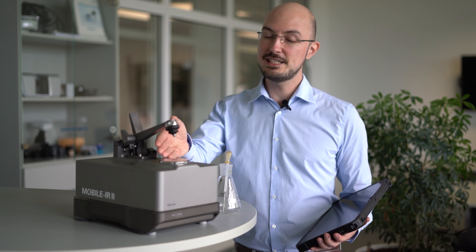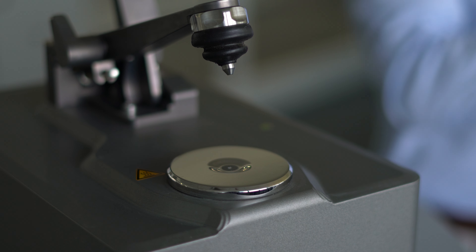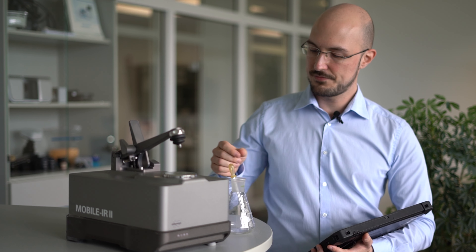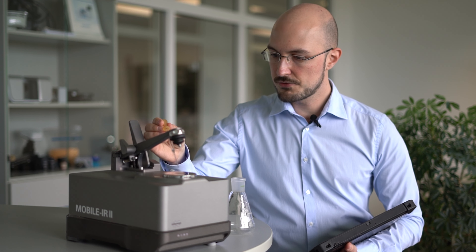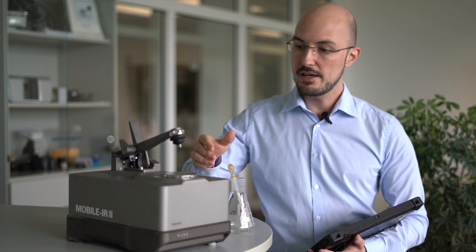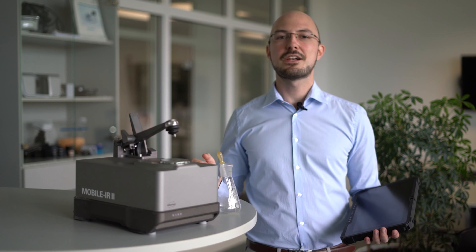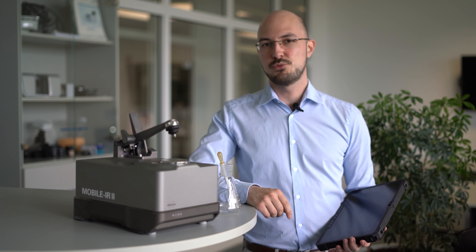There's another practical feature: the heatable ATR crystal. It is extremely useful for users that regularly analyze extracts. You turn on the heat, put a few drops on the ATR crystal, evaporate the solvent, measure the residue, and receive your research-grade results.